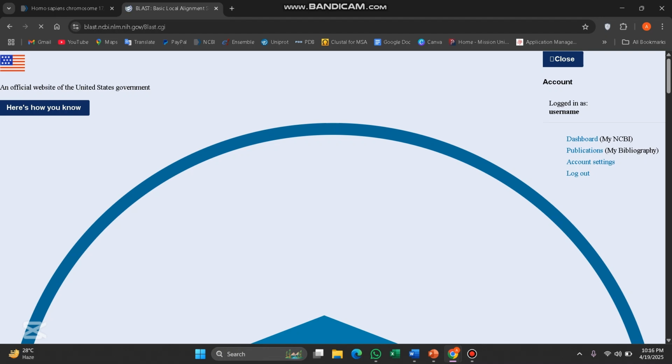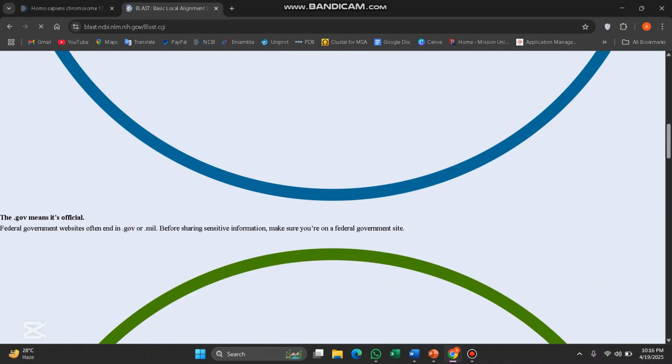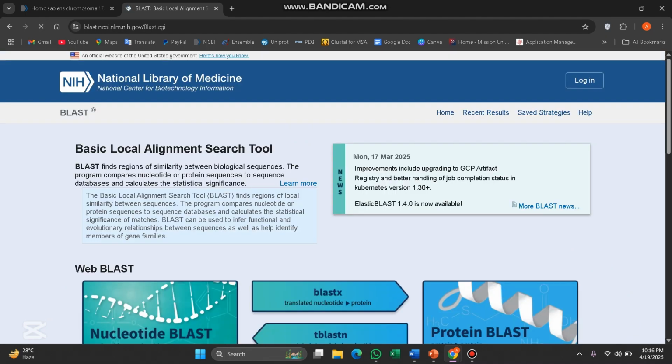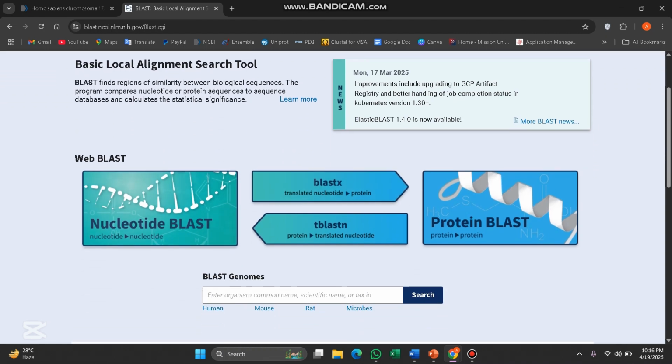The speed is very slow. Click here again. Alhamdulillah. Click on nucleotide BLAST. There are four types, but click on nucleotide BLAST.